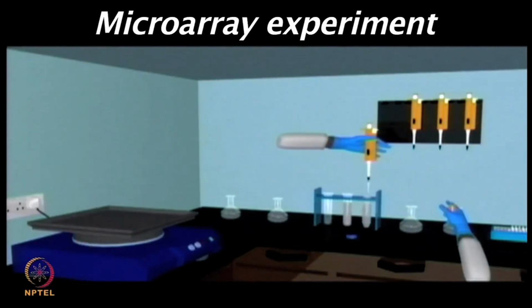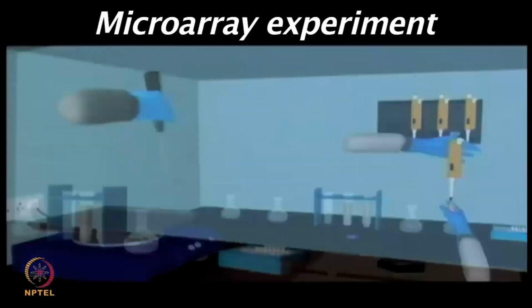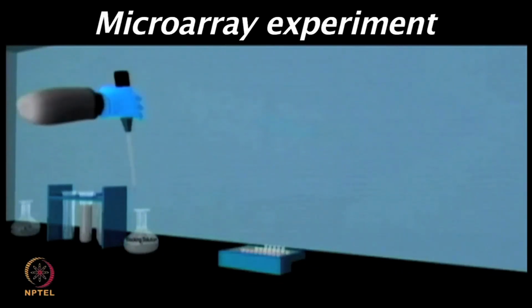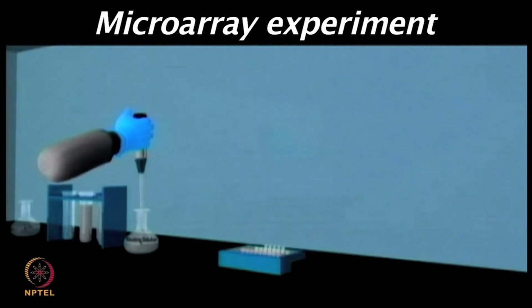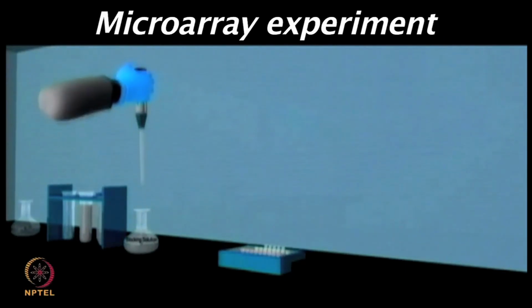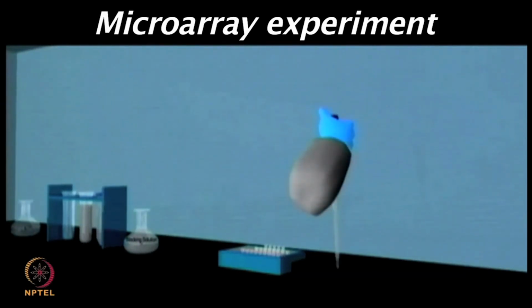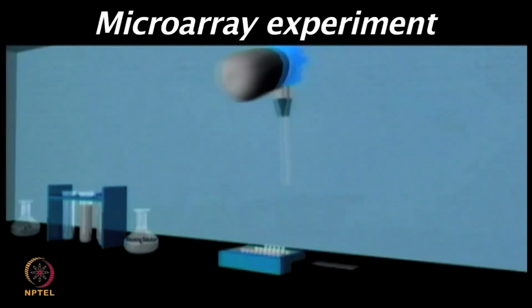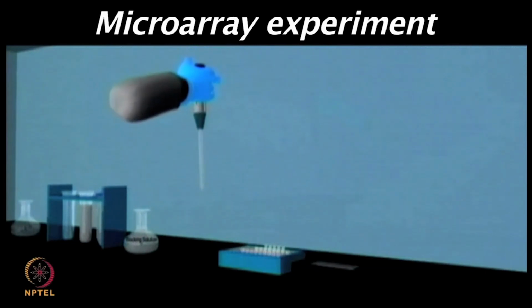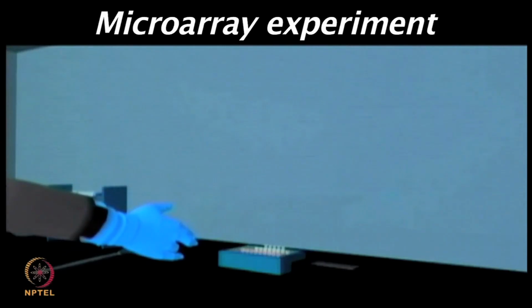So, to avoid non-specific binding, first of all one needs to add a blocking solution. Blocking can be performed by using milk, it can be performed by using BSA, super block, as well as scientists prefer a cocktail of different reagents which could be used for the blocking solution.